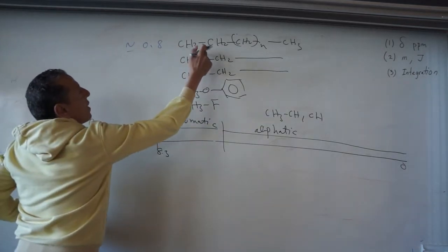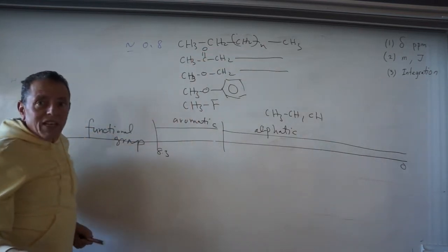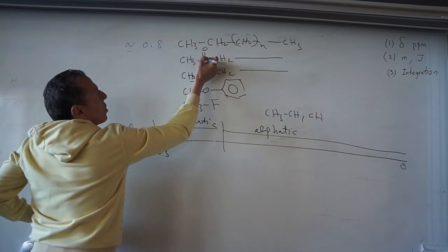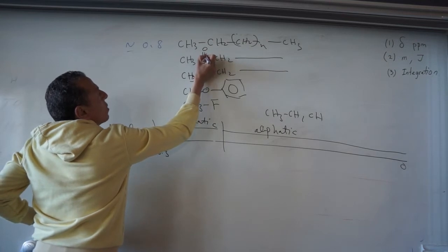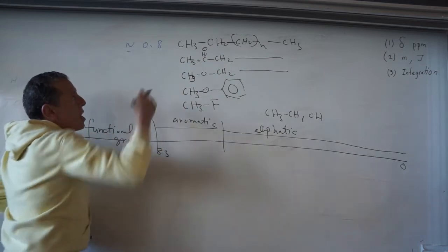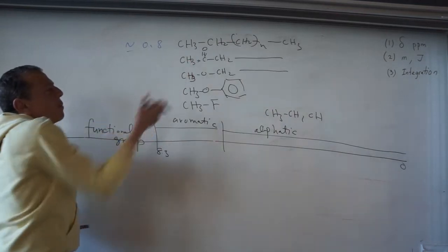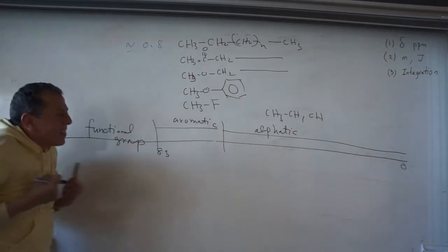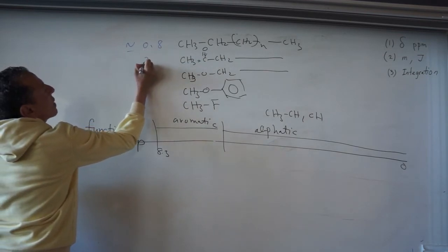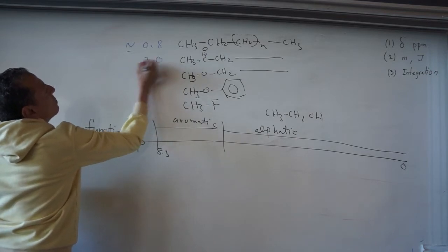What about if you have a carbonyl? The oxygen or nitrogen or sulfur, according to physical organic chemistry, is higher in electronegativity. It starts to withdraw the electrons from here, and accordingly withdraw the electrons from here. So withdrawing of these electrons from the methyl group means the electron density will be less. It means it will be de-shielded. So it will not appear at 0.8. In this case, it will appear around 2.